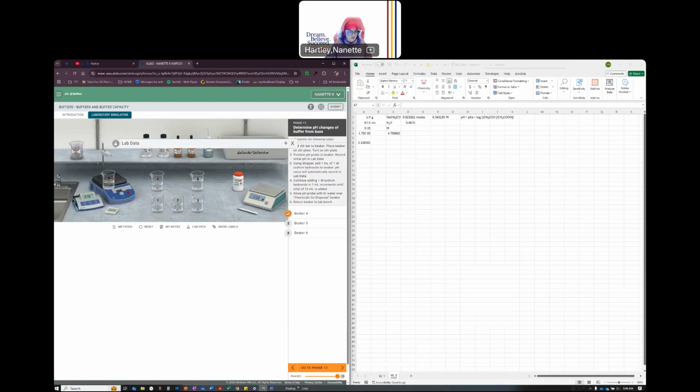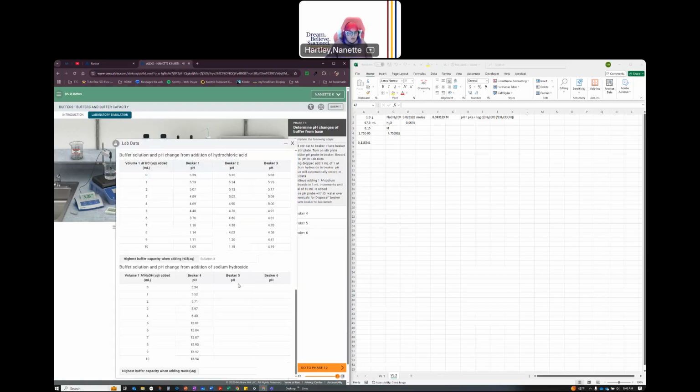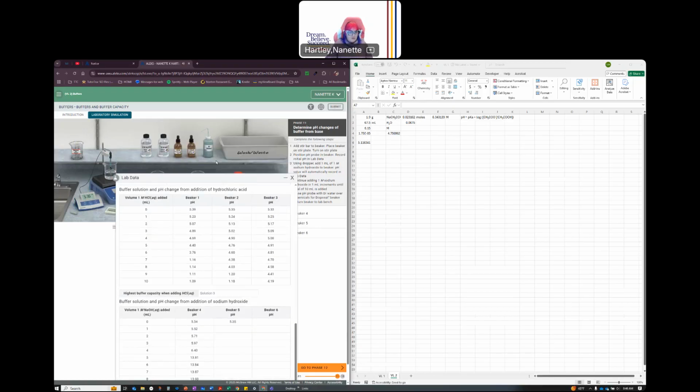Start. 5.35. 135. Almost down. 2, 6, 7, 8. It's back. Take this out. Take this down.